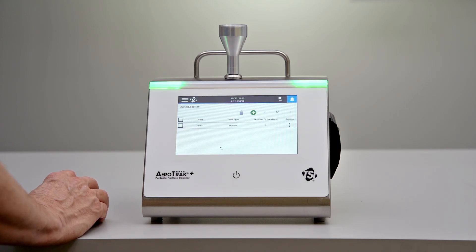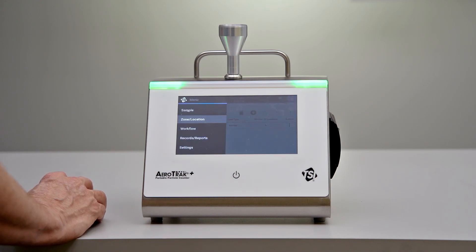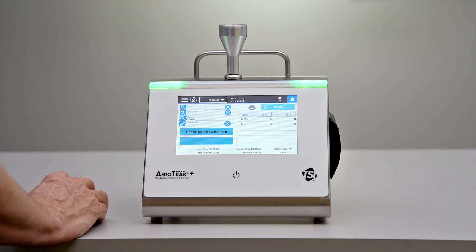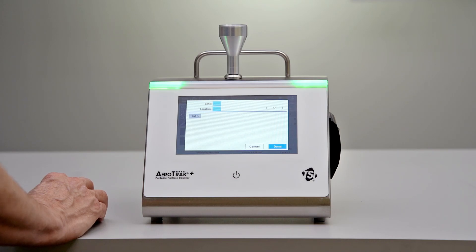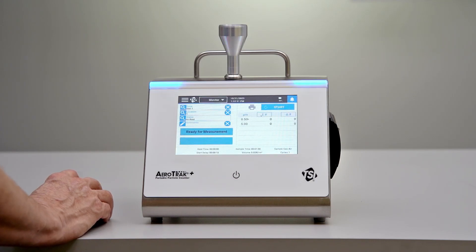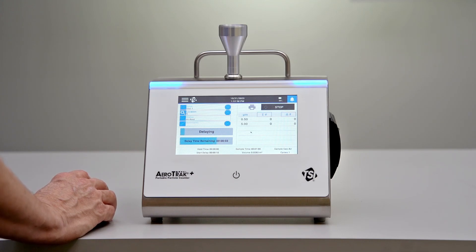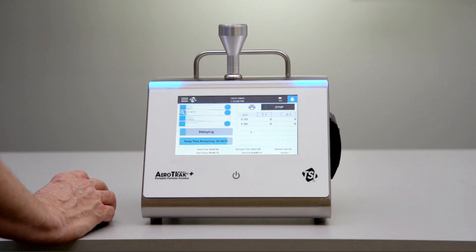And we're done — we've created our new zone for monitoring. If we're going to use that for sampling, we go back to our sample menu, make sure we're on monitor, pull in the new zone we just created, select whichever location we'd like, and start collecting data. That's all there is to setting up a zone for monitoring using the new A100 Aerotrack portable particle counter from TSI.